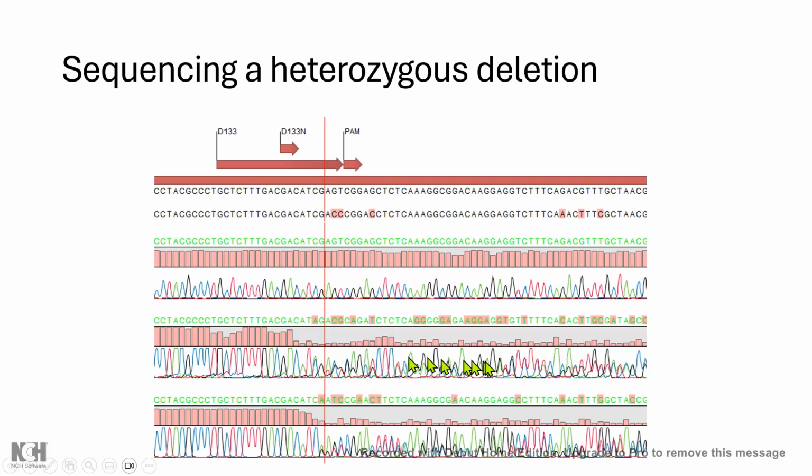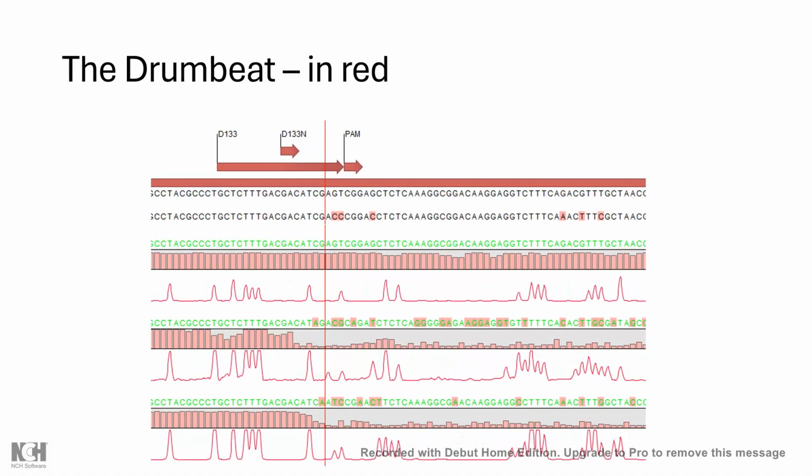Well, I am so glad you asked, because I came up with an approach which I affectionately call the drumbeat maneuver, or the drumbeat method. Point is, drumbeat. Why do I call it a drumbeat? Because after all, think of the 4 DNA bases like 4 instruments on a music track. And in this case, the red, or T, is the drums. So if you take away all the other instruments and only listen to the drums, then stuff changes to this.